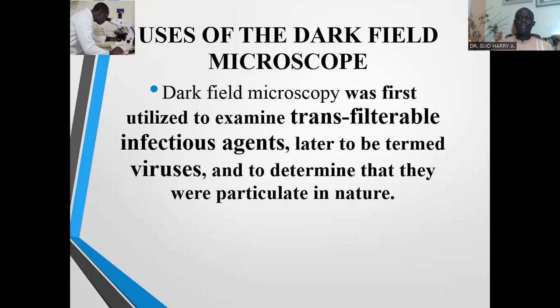The dark field microscope was first utilized to examine transfiltrable infectious agents, later to be termed viruses, and to determine that they were particulate in nature. So it's used to view viruses. Earlier, the viruses were called transfiltrable infectious agents. So these viruses are properly viewed with the dark field microscope.